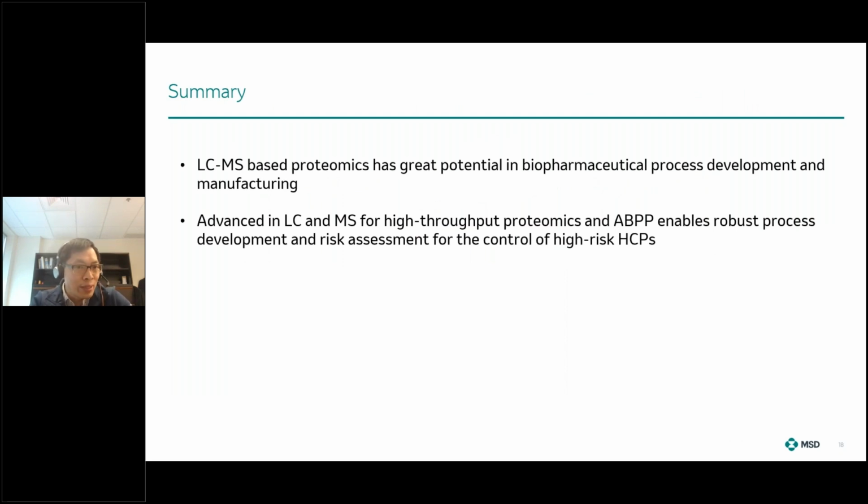I hope I have convinced you that LC-MS-based proteomics has great potential in biopharmaceutical process development and manufacturing, and that advances in LC and mass spec for high throughput proteomics and ABPP enable robust process development and risk assessment for the control of high-risk host cell proteins.